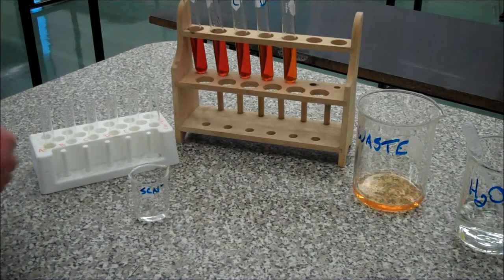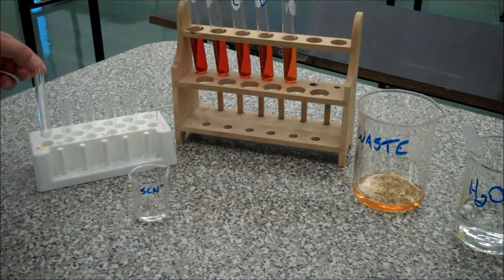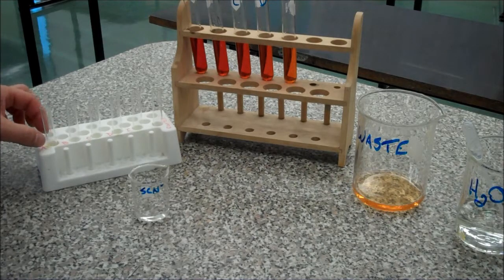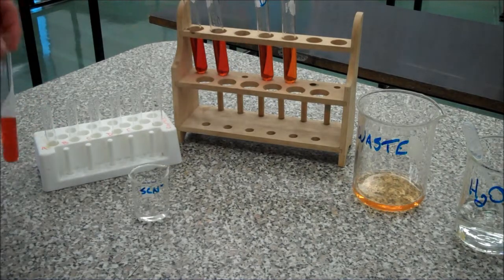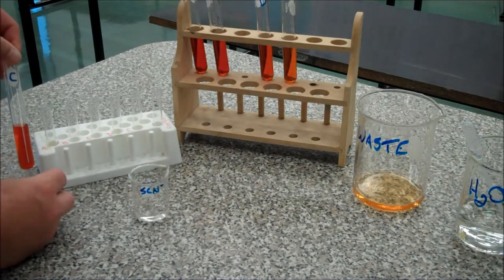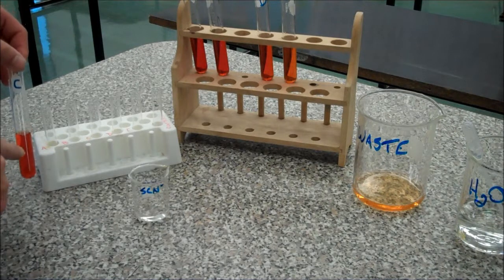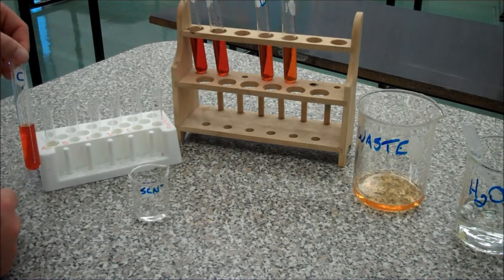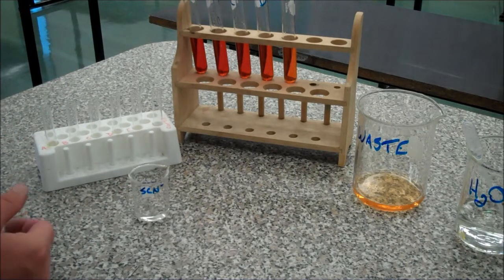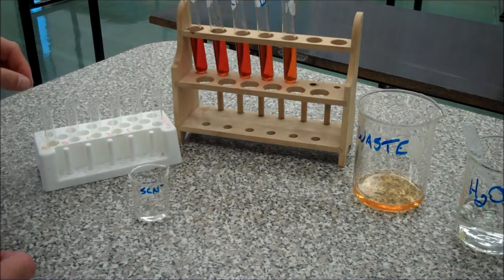Before we set the spectrophotometer up to read the samples, we have to prepare them in cuvettes. These little test tubes are all very uniform in diameter. If you want to know the effect of the diameter of the column of fluid — you can imagine that if it's a thicker diameter, as the light shines through, the thicker the diameter, the more light would be absorbed. So you have to control the diameter very, very well. You could look up on the internet — it's called the Beer-Lambert Law — and that would talk about that in more detail.